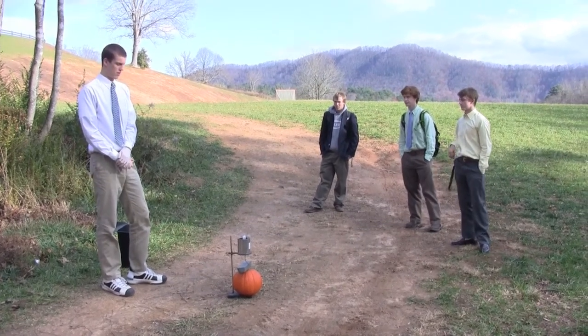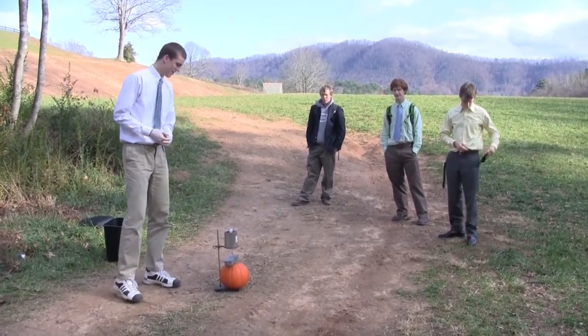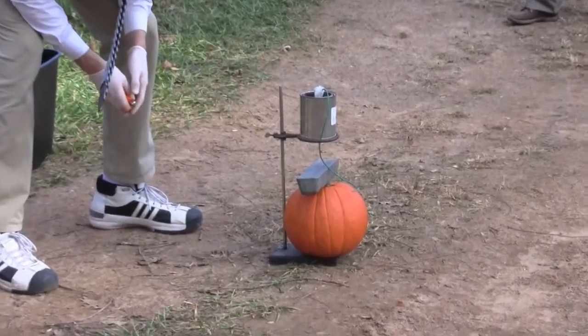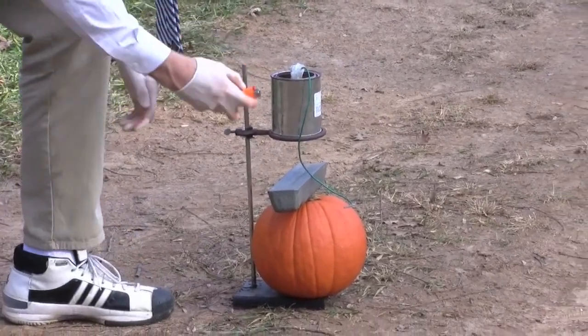All right, Marshall, what are we doing? You're here with the advanced lab techniques class, and we're getting ready to light some thermite. It'll cascade down onto a solid bar of zinc, and then hopefully melt the pumpkin underneath. Let's see how this goes.